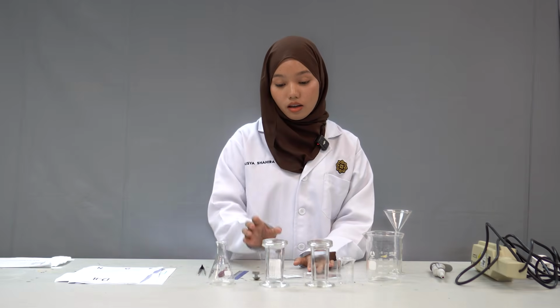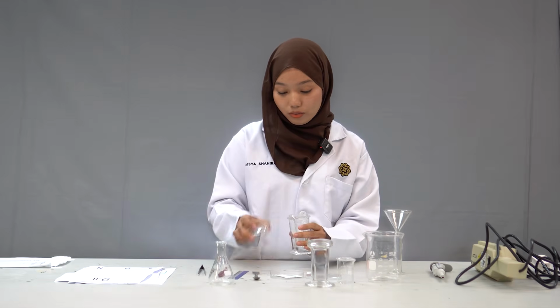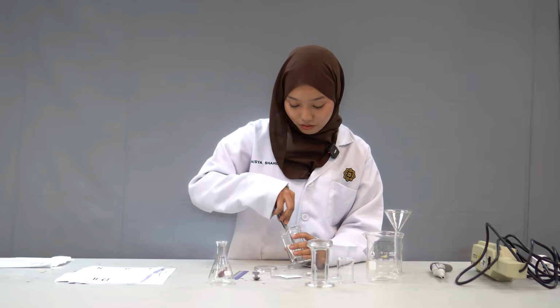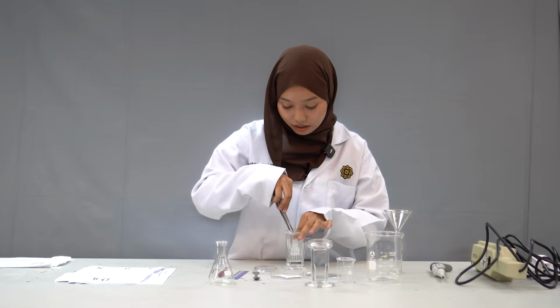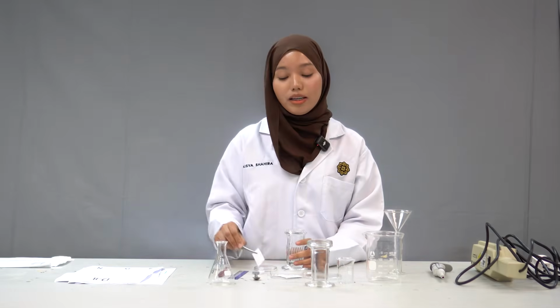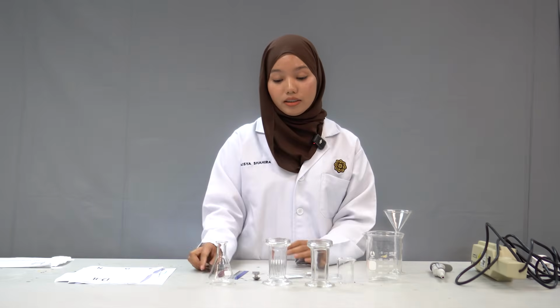Once it's done, we remove the TLC plate from the developing chamber, and now we can measure the spot patterns on the TLC plate.